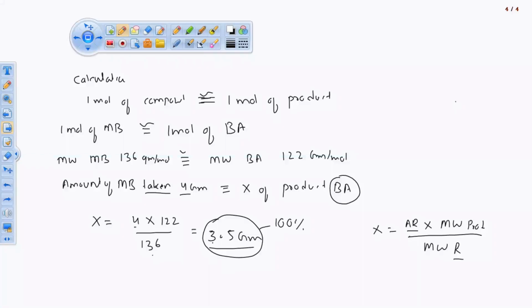If it is coming down less than 3.5, then it is okay, 2.5 आ रहा है okay, 1.5, 0.5 भी आ रहा है, then it is okay. It should not exceed 3.5. 3.6, 3.7, 3.9, 4 ऐसे नहीं आना चाहिए.